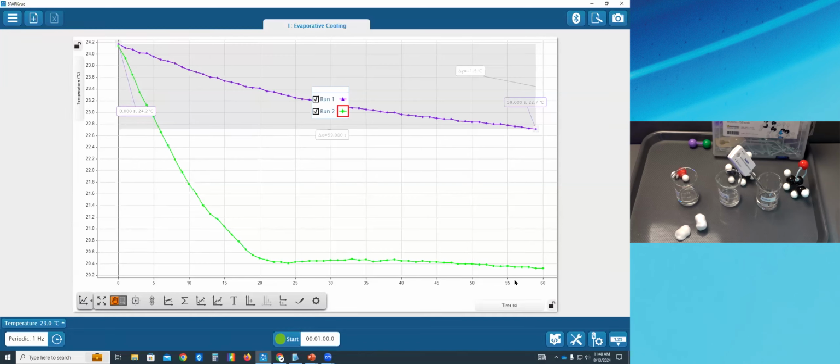Let's say that now I'm ready to analyze run 2, but wait, what's run 1? What's run 2? Let's put some labels on these runs, because that is another thing we want to teach students, is to communicate as much as we can about our data. So let's name the runs.